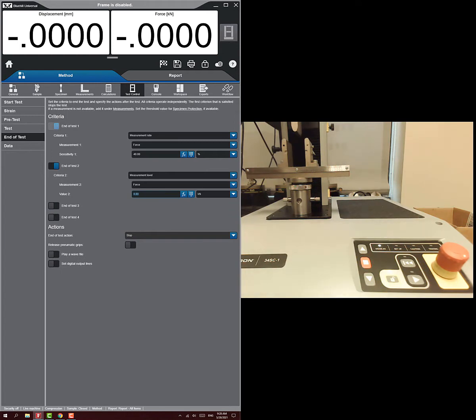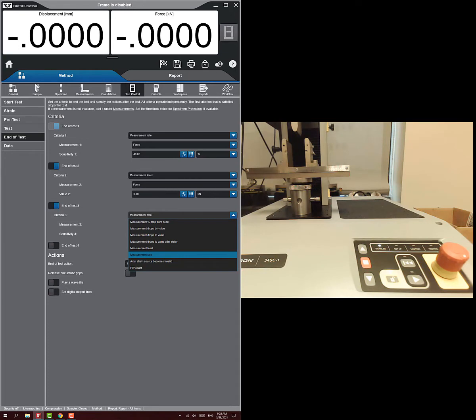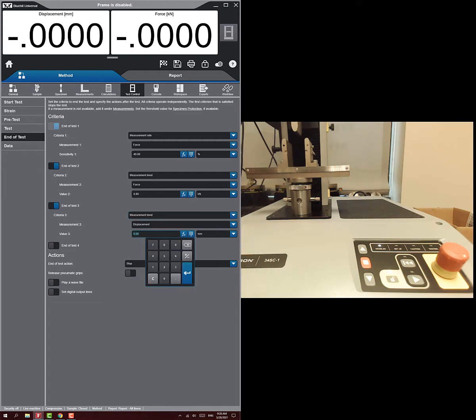We can also add a displacement-based end condition. Since I doubt this deflects more than a half millimeter, I'll set a measurement level for displacement at half a millimeter. When either of those criteria is hit, the test will stop. For the end-of-test action, we can choose to stop or return the crosshead.